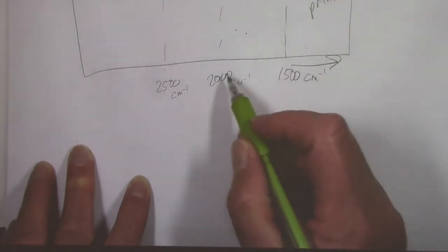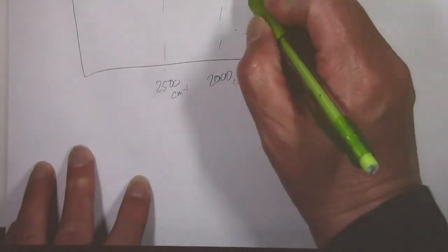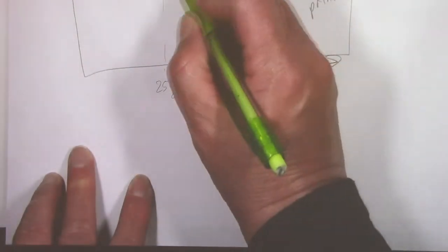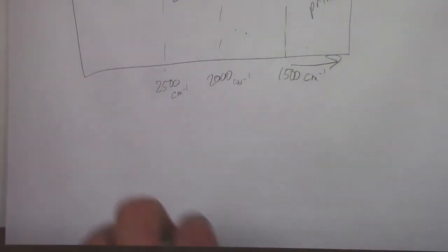And then in here, say 2000 to 1500, right? That's where we find our carbonyl groups. We also find our carbon-nitrogen double bonds and our carbon-carbon double bonds, but we're not going to worry about those. And then 2000 to 2500, right? The range is technically smaller than that, but I'm just keeping the numbers round. That's our triple bonds. Remember, we cannot have a carbon-oxygen triple bond because that's too many bonds to oxygen.